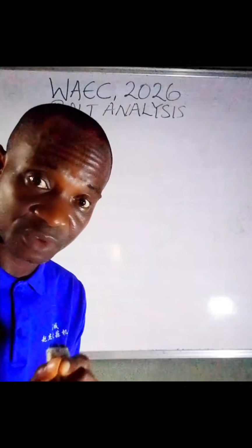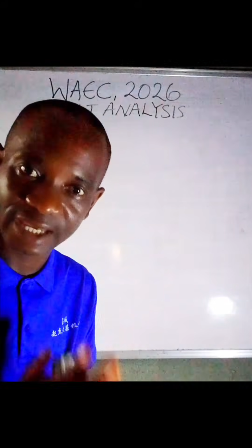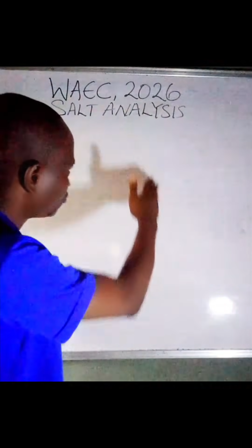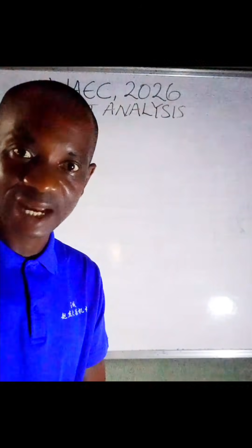This one is for those who are preparing to write WAEC on their own. There are schools that don't entertain any form of expo, and some students are really afraid. I am focusing on number 2 of your WAEC practical, called qualitative analysis or salt analysis.